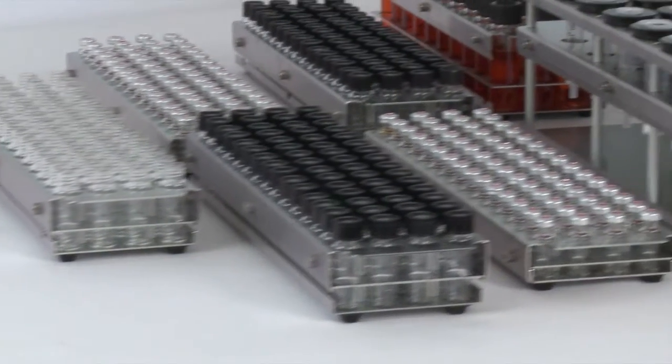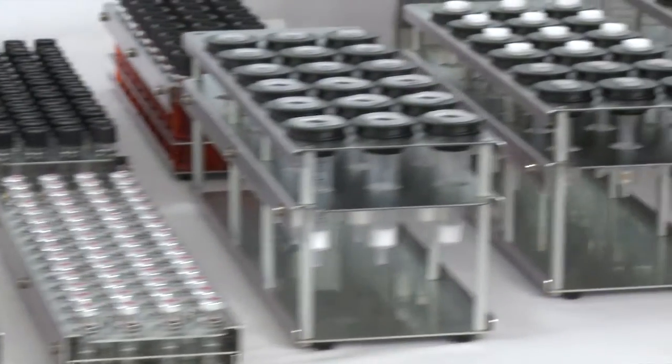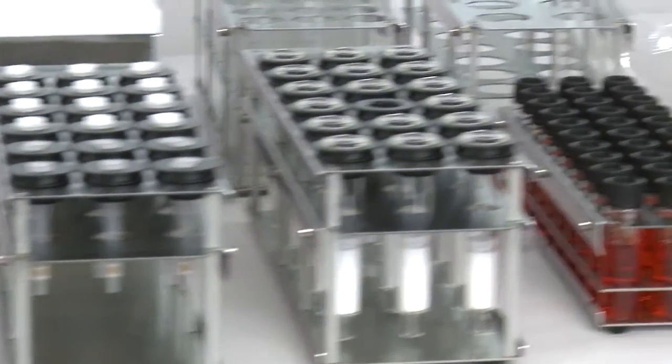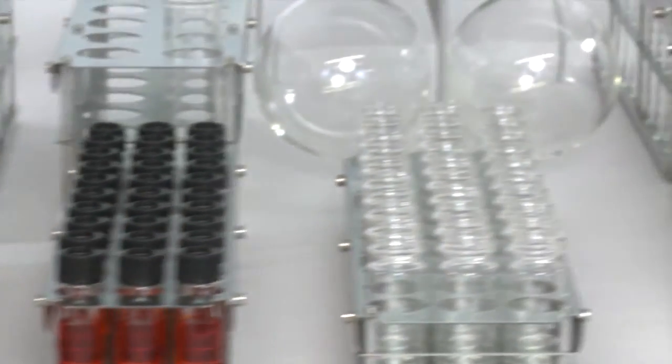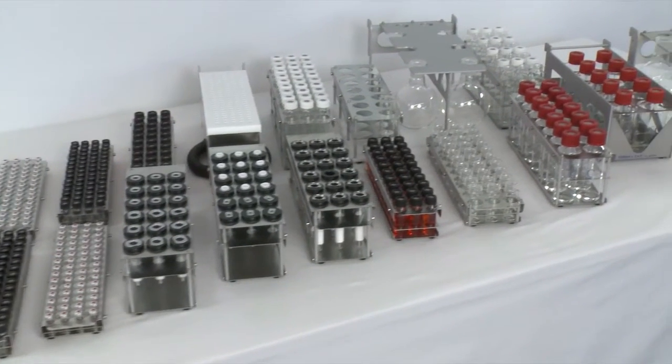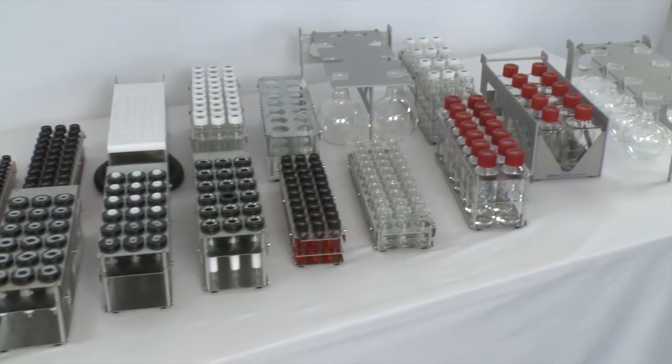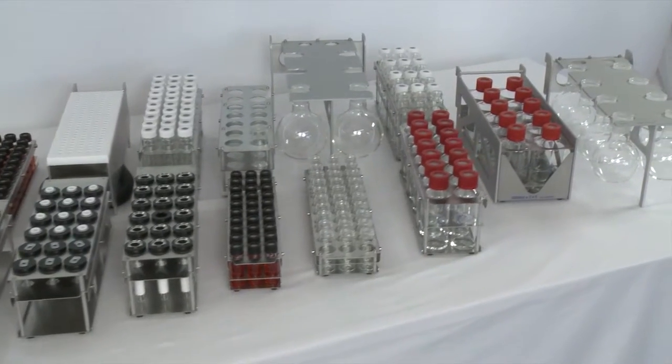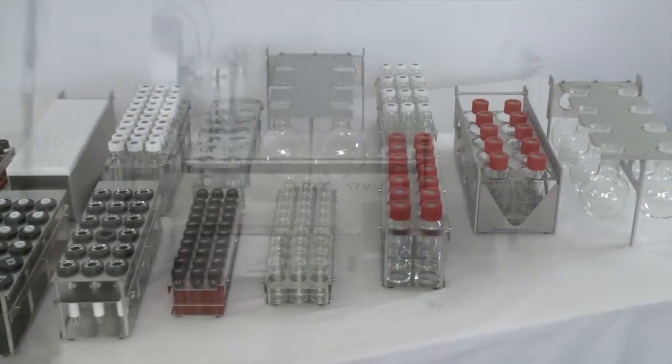More than 40 different racks can be freely combined in the freestyle system at any time. Each rack with different sample containers. Depending on the actual load, up to 180 samples can be automatically processed in one go using only one platform.